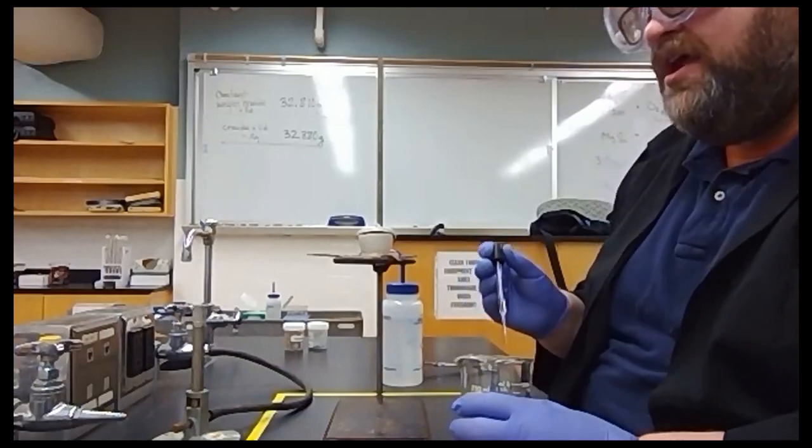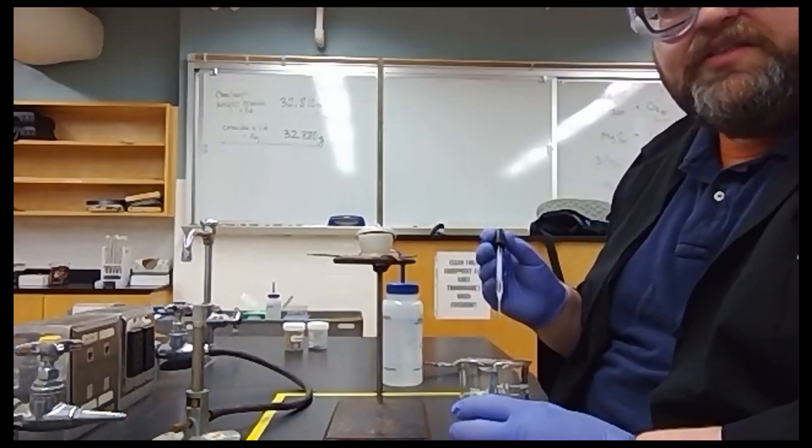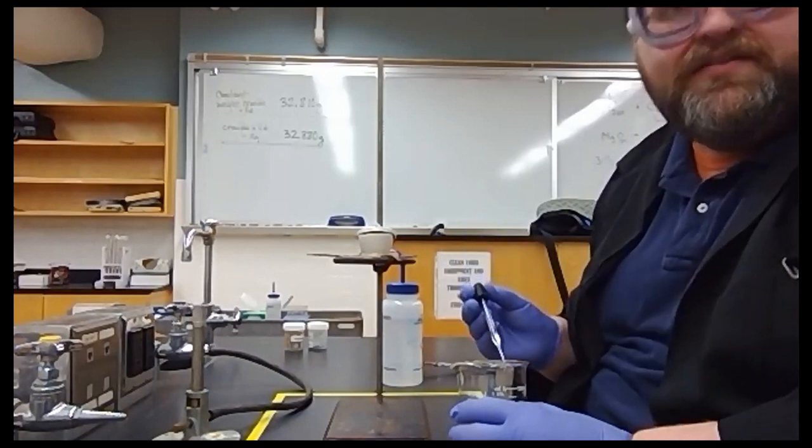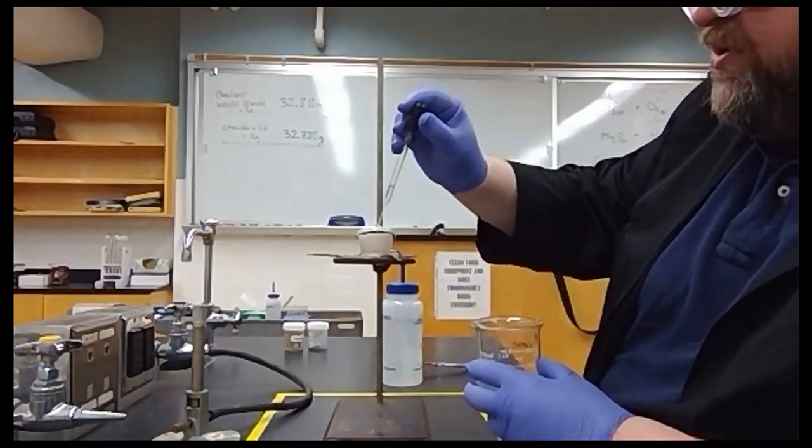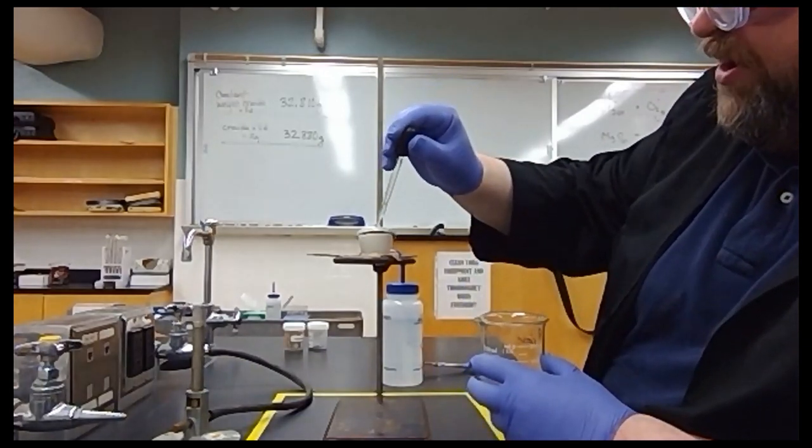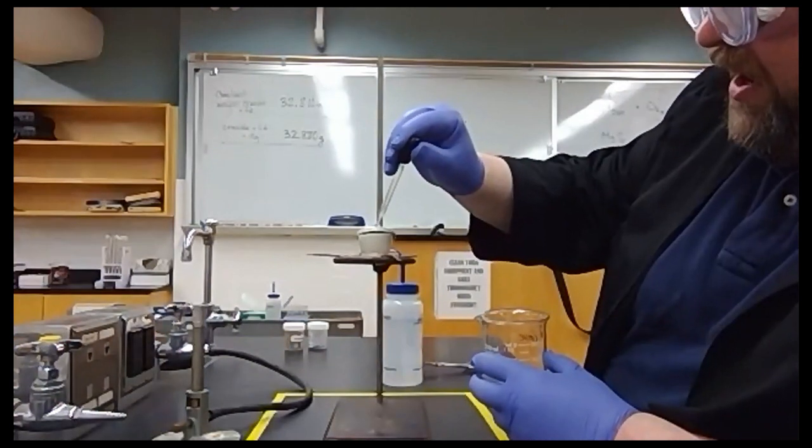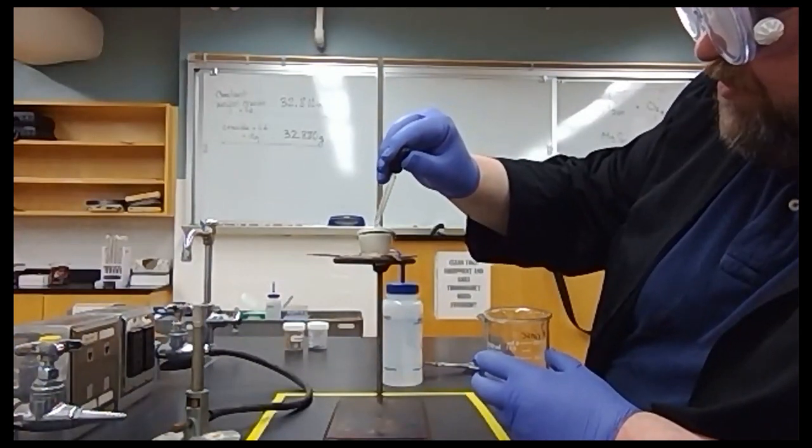Then I'm going to take one dropper full of water. This is way more water than is actually needed to do this conversion, but I want to make sure that I get it all. It's better to have an excess of one reagent that I can easily remove than to not have enough. So I'm going to put my water in here and we're going to notice steam coming out immediately. And just drop by drop I'm going to add this water to our magnesium compound.